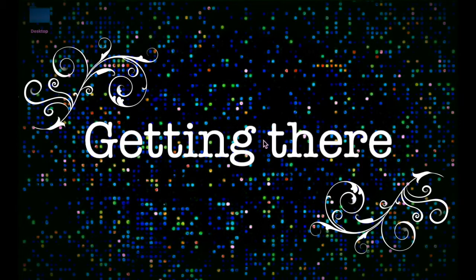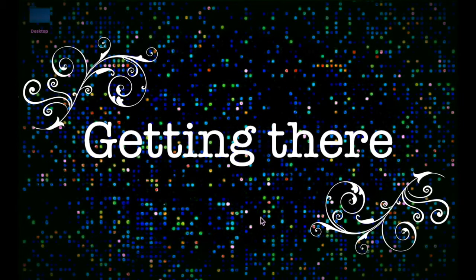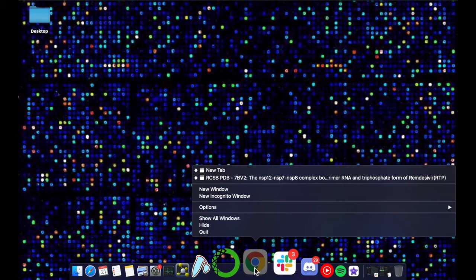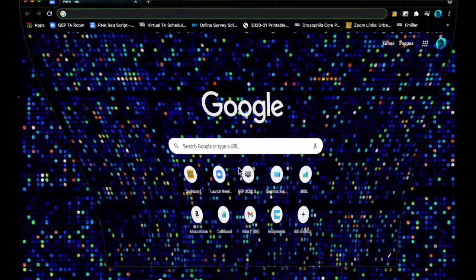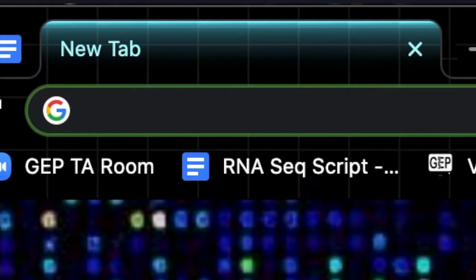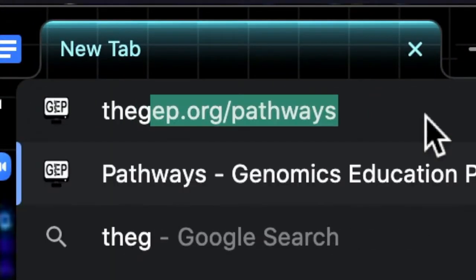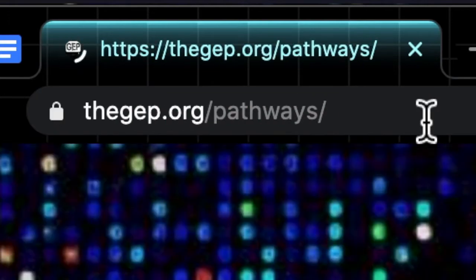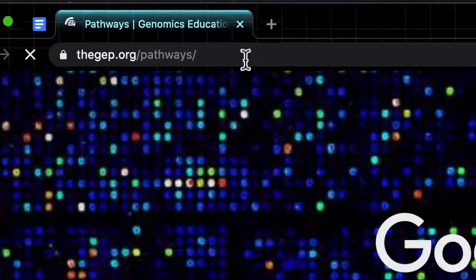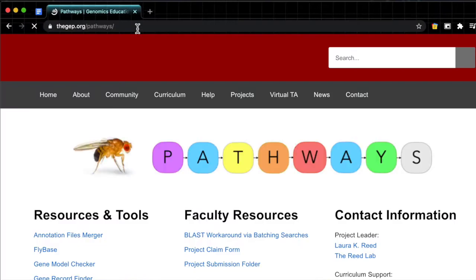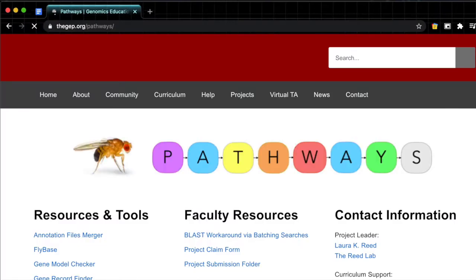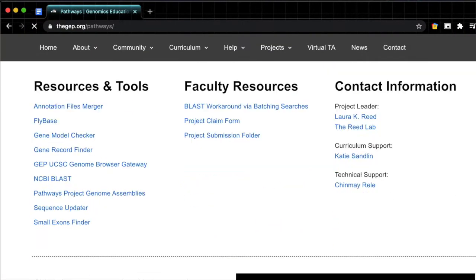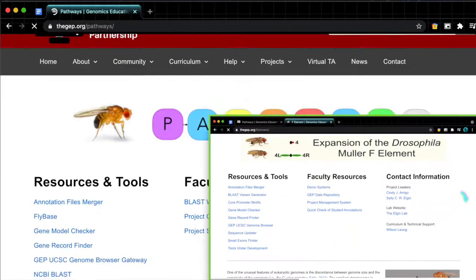First, let's bring up the UCSC Genome Browser, and let's start by going to thegep.org/pathways or /felement, depending on what project you're working on. For the sake of keeping today's video consistent, I'm going to be sticking with pathways today, but here's a little glimpse at what the homepage for the F element looks like.